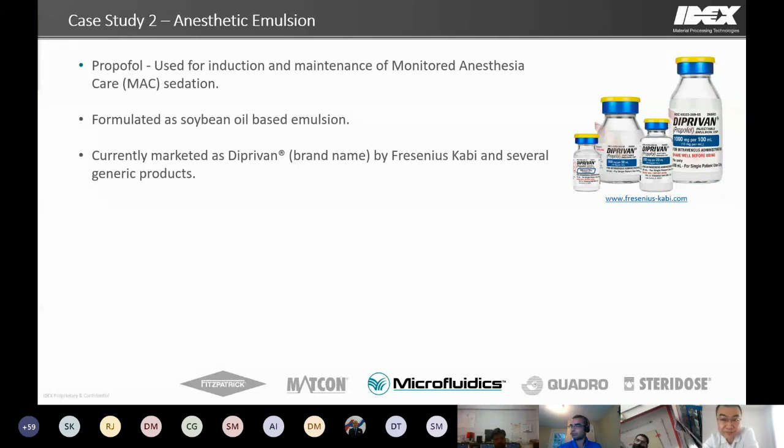In general, our system, the first requirement for initial particle size is that it should be in a good range where the emulsion is stable, or the pre-emulsion, the coarse emulsion, is stable. We don't want to see phase separation before passing through our system. That's the first requirement. After that, our system is actually robust enough. Usually we see the system can accept a very good range of pre-emulsion, ranging from several microns to several tens of microns. That usually yields very similar results.